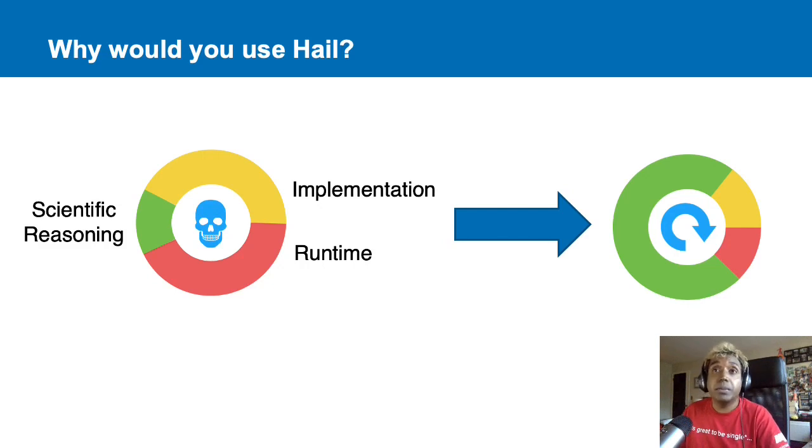Wow, it took me probably in total about 15 or 20 minutes for 4,000 genomes. And this was Hail 0.1 in 2016. I've tried implementing this in Hail 0.2 just for fun, just to see how it works and how fast it is. It is probably two times, if not four times, faster than my code running with Hail 0.1.